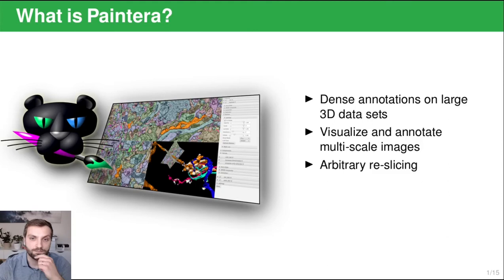So what is Paintera? Paintera is an image annotation tool with the goal of enabling productive annotation of large 3D datasets. Paintera is cross-platform and leverages JavaFX for its UI, ImgLib2 for its data management, and BigDataViewer for visualization. The typical workflow for Paintera is to load your image data, create or load a label image, and begin annotating. The main annotation method is the paintbrush, but there are additional tools which help streamline the annotation process.